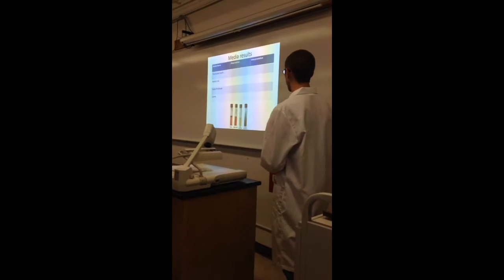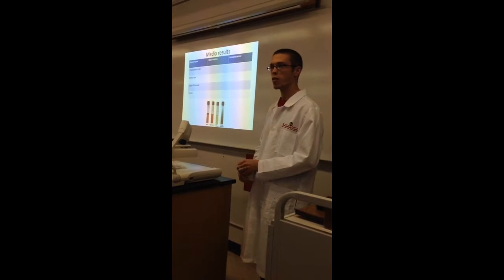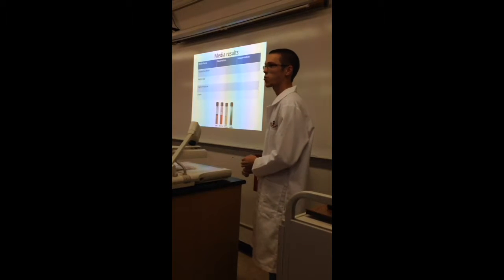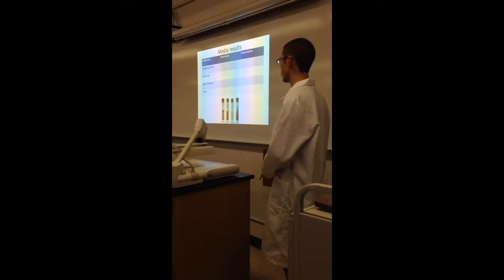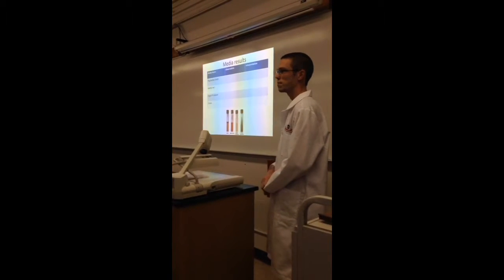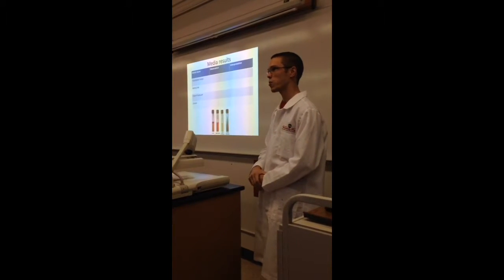So here's an example. We have indole, methyl red, Vogts-Proskauer, and citrate. For the tryptophan broth, what would the observation be? You probably can't see that in the back, huh? It's too small. It's red. So that would just be the indicator turning red for tryptophan. What about methyl red? It's red. So methyl red, if you remember, the media starts yellow, and when you add the indicator, if it's positive, it turns red.